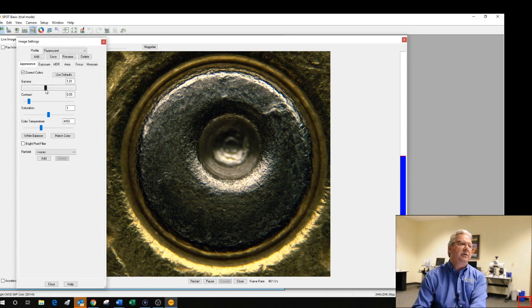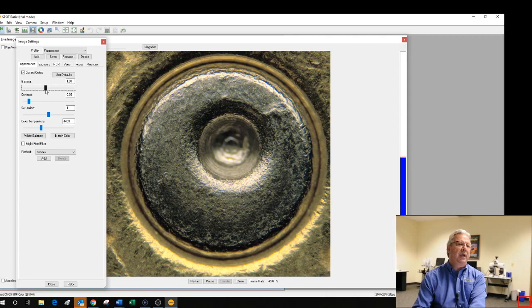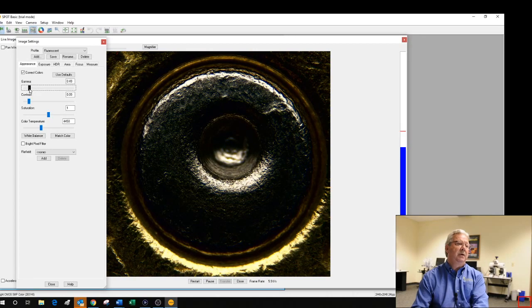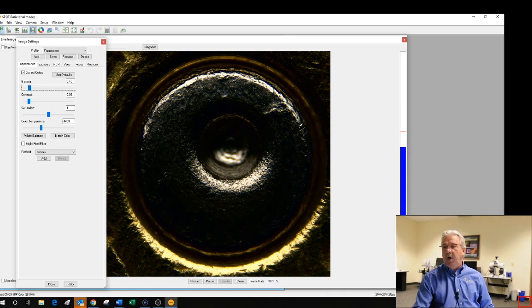And what gamma is going to do is cut down some of your dynamic range. But for example, here, if I had a feature in the dark area, you can see by pulling gamma to the right, I've made it brighter, if you will. I can also take the gamma the other direction, and if I had something that was in one of the washed out or bright areas, I could darken the image so that we might be able to see them. Gamma is a sacrificial technique.